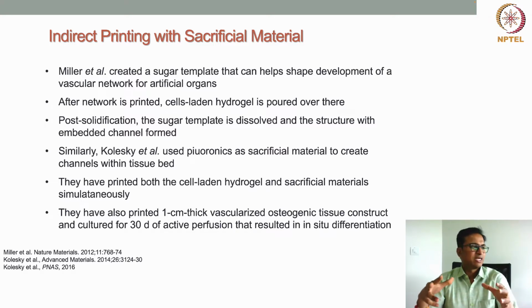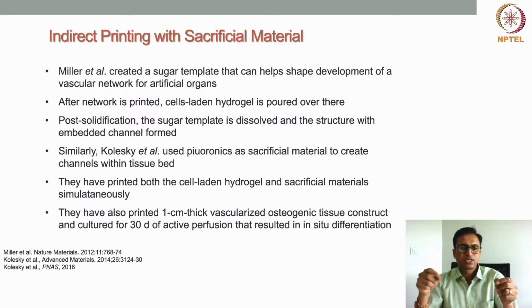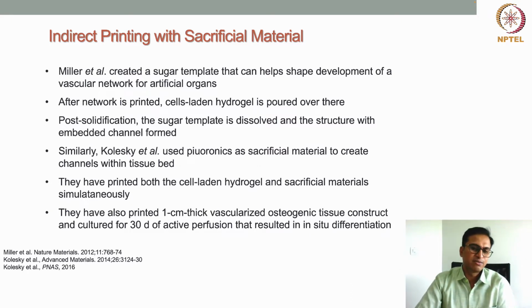Then the cell and hydrogel was allowed to gel or solidify. Then they washed it with water or media, and the sugar dissolved away. After the sugar dissolved, it left channels within the tissue block prepared from the cell and hydrogel.